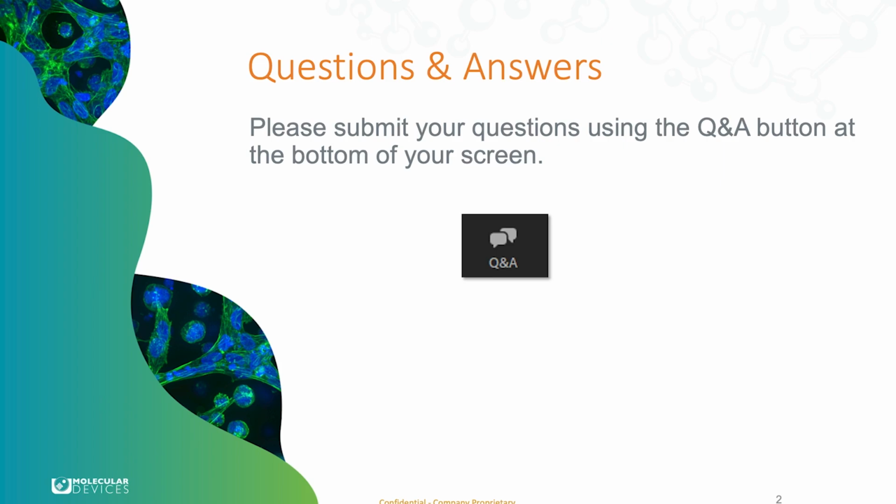Another one here. Which software is used for recognizing or masking organoids in a well? And how accurate is it? Pardon me, what was it? And how accurate is it? Accurate. So we're using it for object segmentation.